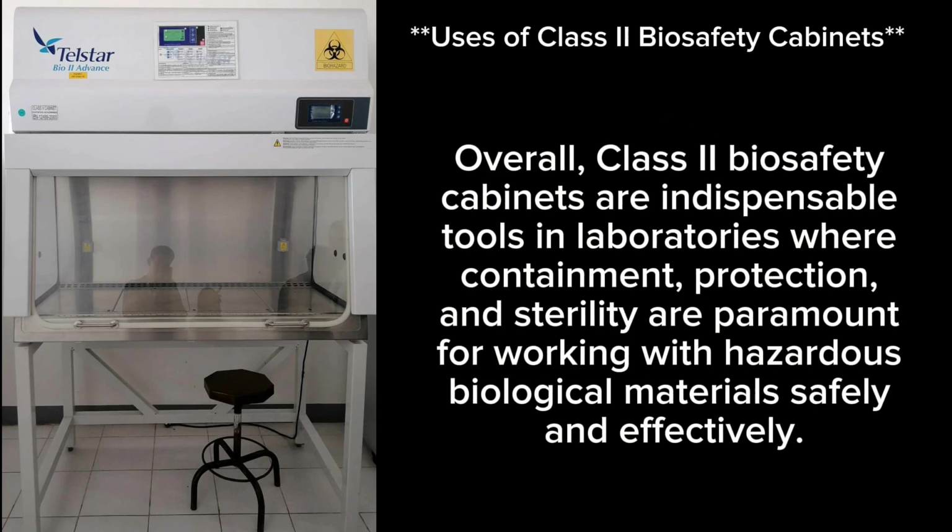Overall, Class 2 biosafety cabinets are indispensable tools in laboratories where containment, protection, and sterility are paramount for working with hazardous biological material safely and effectively.